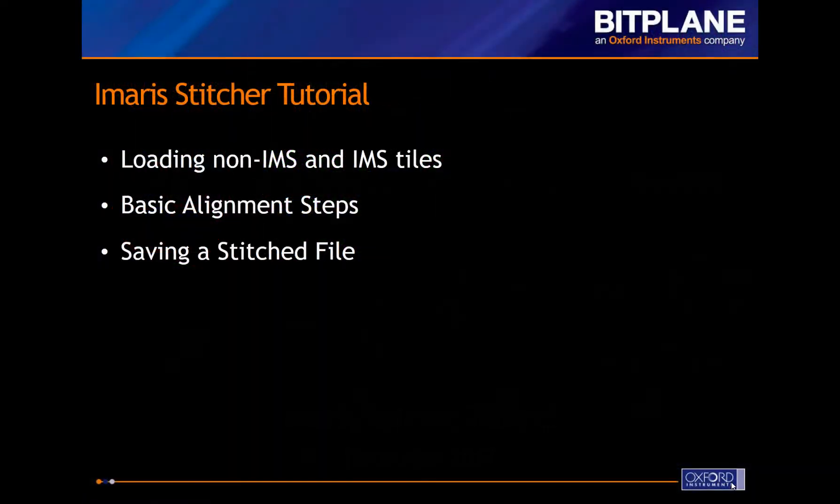Today I will walk you through loading non-Imaris as well as Imaris files as tiles. I'll then show you the basic steps of aligning those tiles based on their overlapping content, and lastly how to stitch those tiles together and open the stitched image within Imaris.